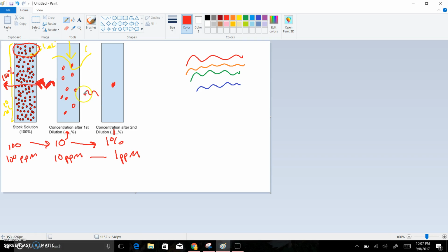I'd see a high transmittance of that. Looking at the next one, if I shot red light through this next one, not as much would go through because it's not as dark of a red color. So a majority of it would go through, but maybe it wouldn't be 100%. Maybe it'd be something like 80%, something like that. Still less. Some of it would be absorbed by the other parts, like the water parts, perhaps. And then if you look at the last one, and I shot red light through this one, a lot of it wouldn't get transmitted through. A lot of it would be absorbed because you don't see that dark, rich red color. So maybe this would be at like 20%, something like that. It's still a red color. We still want to be able to transmit red to our eyes, but it's not as deep of a red color, so you wouldn't get as much. Okay, I hope that helps on what the transmittance thing means.